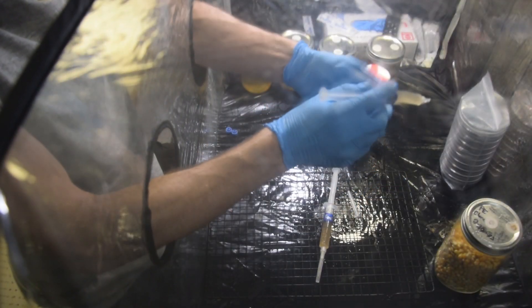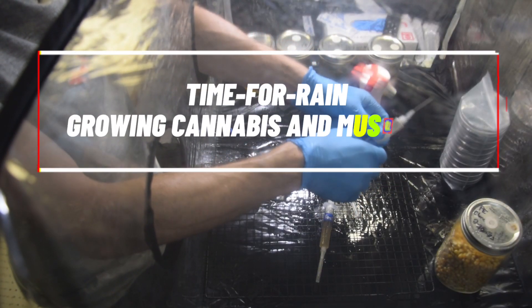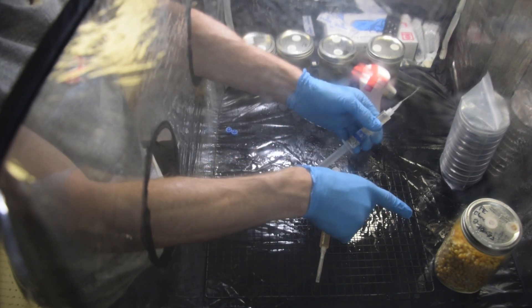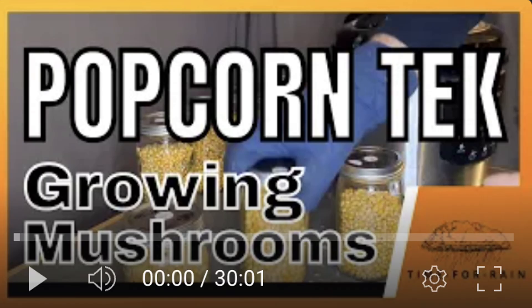We have our grain spawn and our liquid culture syringe, so we're ready to inoculate. If you haven't watched my video on how to prepare your grain spawn — this is popcorn grain — be sure to watch that first.